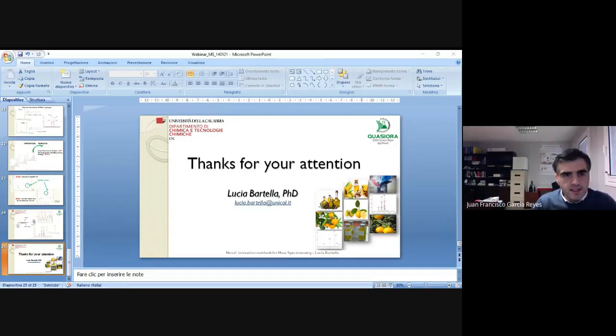Thank you very much, Lucia. It was a really interesting application because it's an actual application in which we are using ambient mass spectrometry to try to meet a criteria set by regulation, in this case by the European Union. So this is really important to show that this is not a toy, but something that can be really useful for laboratories. Anyone of you in the audience have any question?